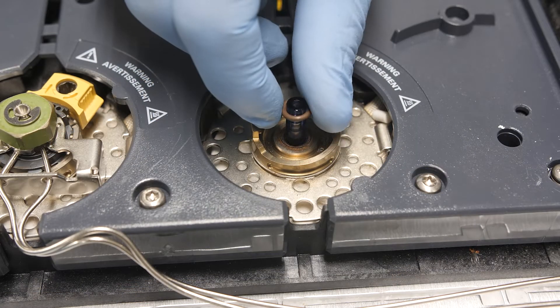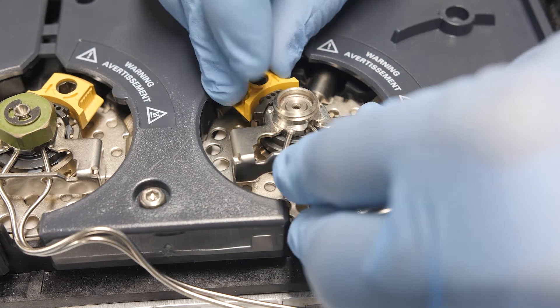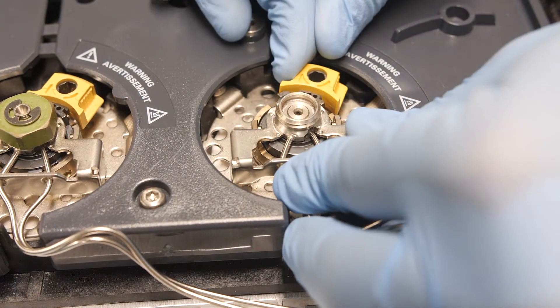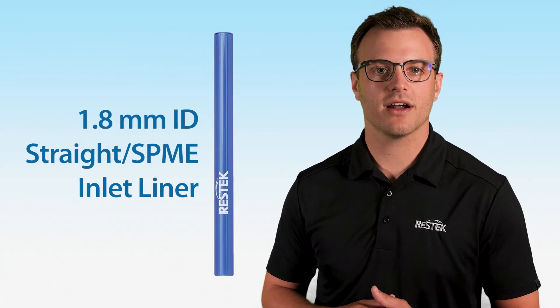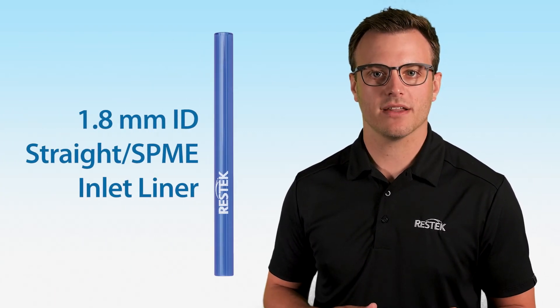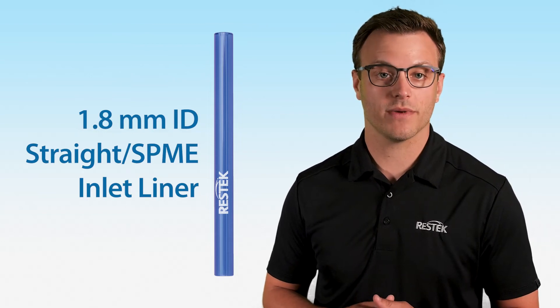Finally, you will need to change your GC inlet liner. For SPEMI applications, we typically use a straight liner and avoid liners with any unique geometries. For SPEMI Arrow applications, we recommend an inlet liner with a larger ID, like the 1.8 mm ID straight SPEMI inlet liner, which is compatible with both the 1.1 and 1.5 mm arrows.